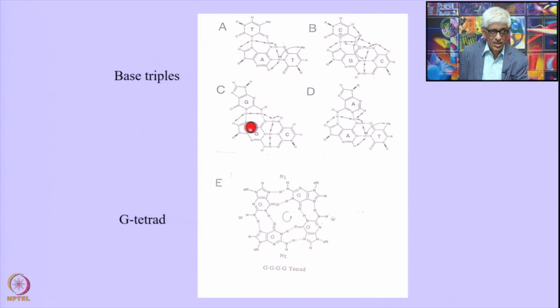And now what are these arrows here? These arrows are indicating which are the short distances, because these are the observables in NMR spectra. See, what are indicated are the proton-proton distances. All these proton-proton distances are short distances, and we use these short distances to identify or assign the individual bases and the individual protons. That is why these are indicated by double headed arrows, that we can actually observe these by recording spectra in water.